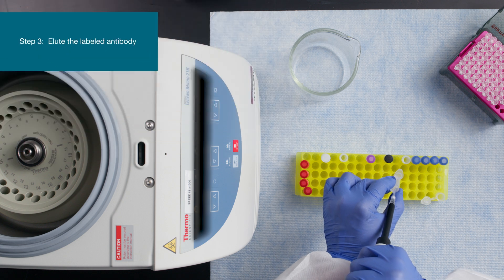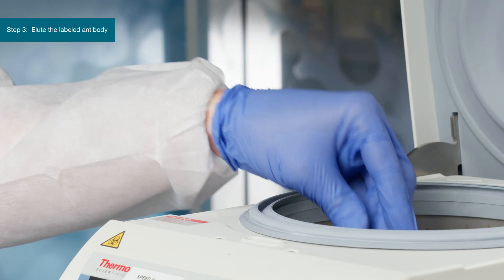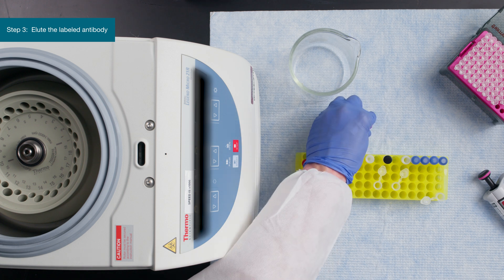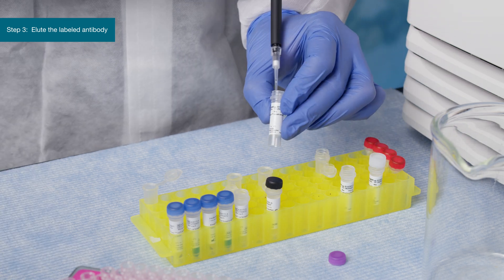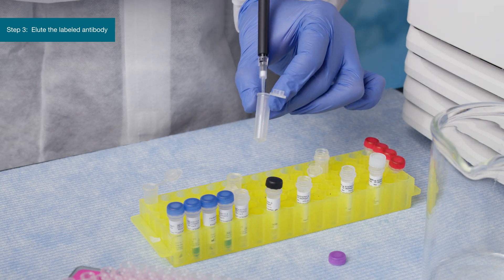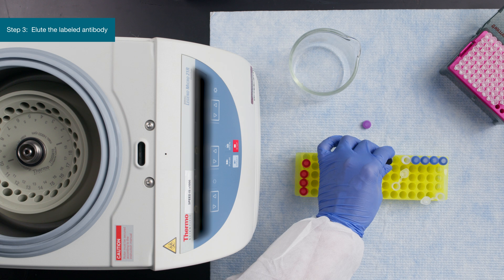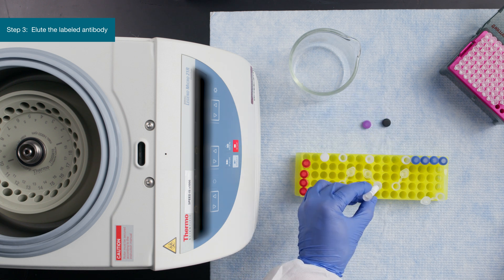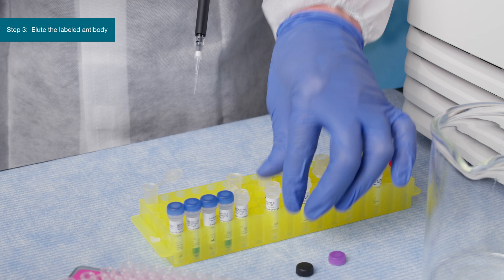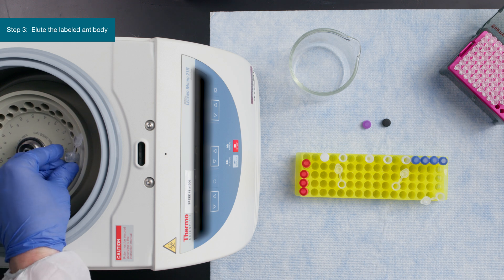The third step is to elute the labeled antibody. Add 100 microliters of wash buffer to the column, centrifuge at 1,000 Gs for 30 seconds, and repeat. Then add 15 microliters of neutralization buffer to a clean 1.5 milliliter centrifuge tube and transfer the washed column. Add 60 microliters of elution buffer pH 3.3 to the resin. Centrifuge at 300 Gs for 3 minutes and collect the eluted antibody.